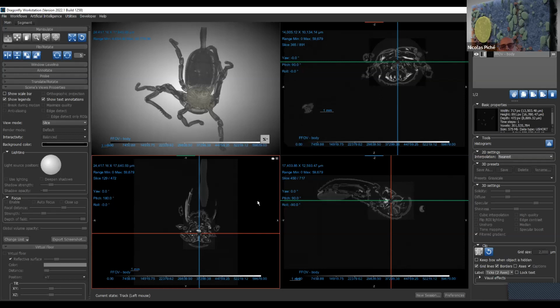What I want to say is that we interpolate and we do no integration, no min or max or anything like that. Why am I talking about that? Because I will talk about MIP. There's a minimum intensity projection and a maximum intensity projection. The minimum is the little m, the maximum is the big M. It's a medical convention. And there's also the average.